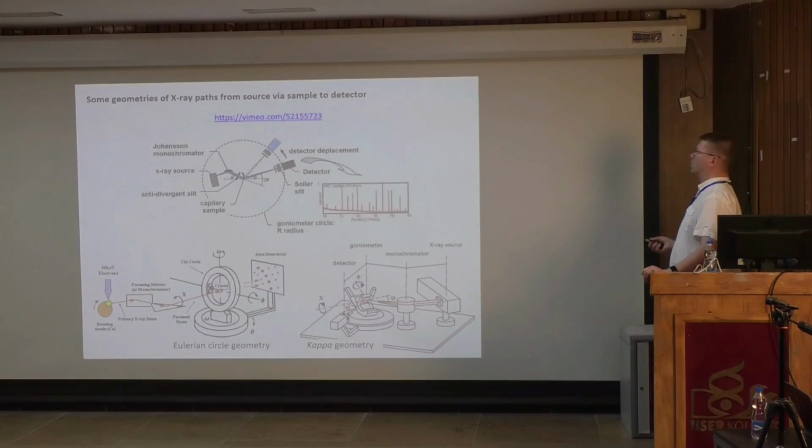I will not go through this powder diffractometer geometry, but these are the simplified versions of the whole diffractometer. So in here, this is a rotating anode, we create the X-rays, we put them through a monochromator or a filter. Now we do this with the monochromator, they will then hit the crystal. It's monochromatic. This instrument part here is called the goniometer, that's the robot which rotates the crystal.